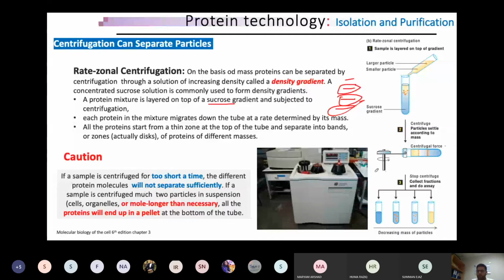This is not a normal centrifuge machine present in the lab. It's a floor centrifuge machine, which is bigger, just like a refrigerator or washing machine in your home. Of course, the washing machine in your home is also a centrifuge machine. If you think for a moment, what it does is the same thing. You have a rotor which spins quickly.